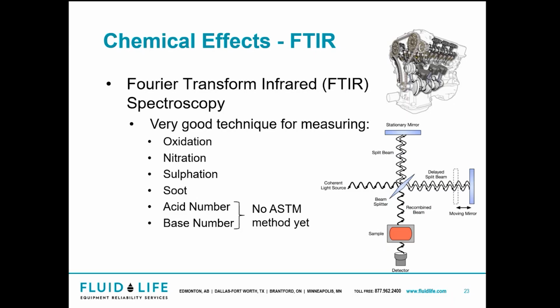So a low-powered infrared beam gets converted to a uniform pattern of constructive and destructive interferences. That interference pattern is passed through the sample, where it's altered by the elements present. The altered pattern enters the detector. It gets converted to an audible frequency electronic signal, which is then processed using Fourier transform analysis. This results in individual wavelength amplitude data, and it gets plotted along a wavelength spectrum, which is compared to a reference sample.